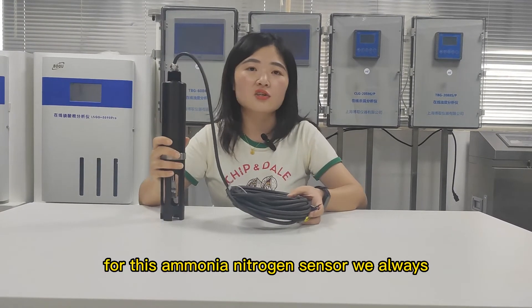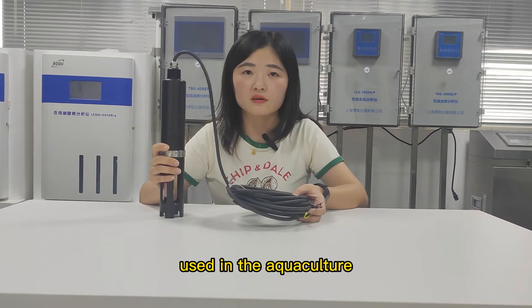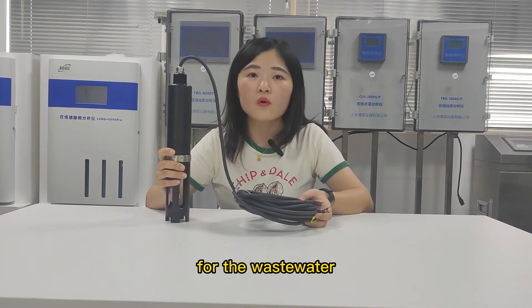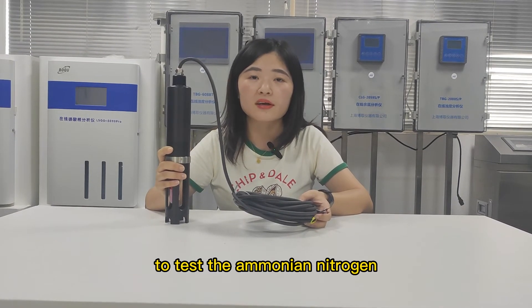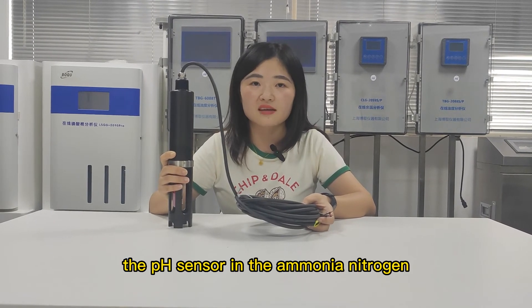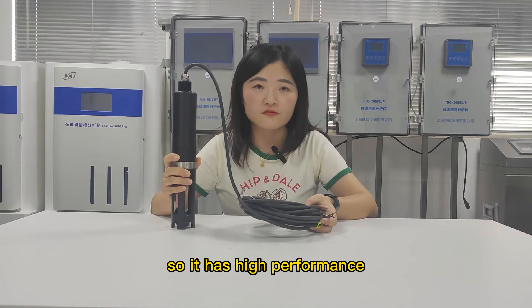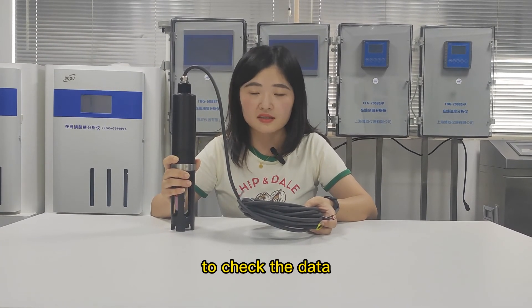This ammonium nitrogen sensor is commonly used in aquaculture, such as shrimp farming and fish farming, and also for wastewater monitoring where testing ammonium nitrogen is essential. It is especially important to integrate the pH sensor with the ammonium nitrogen sensor. It delivers high performance and makes data collection very easy.